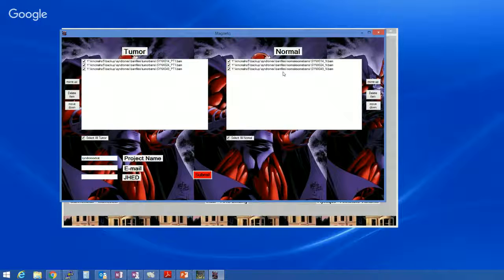We have slashes that we can use from our path, but that's it. Don't put any backslashes. It has to be just underscores. Keep it real plain, and that's going to have to be for the name of wherever you've put these BAM files. Make sure that none of the folders in that path have a space. Otherwise, the whole thing will crash.